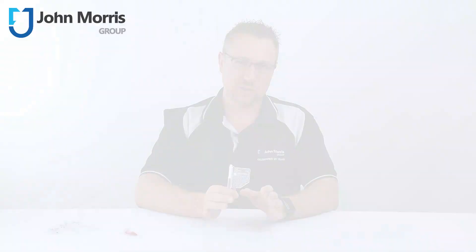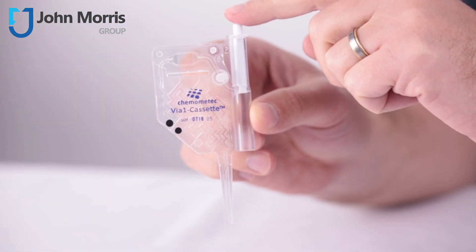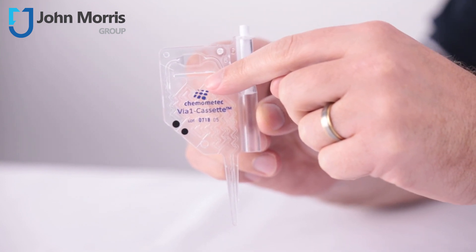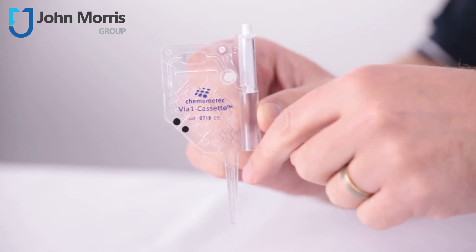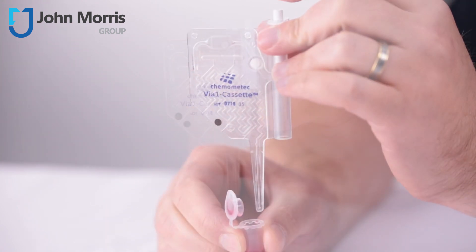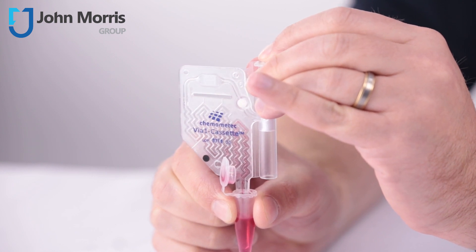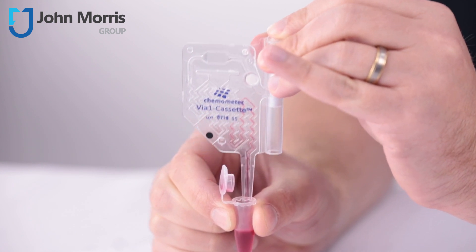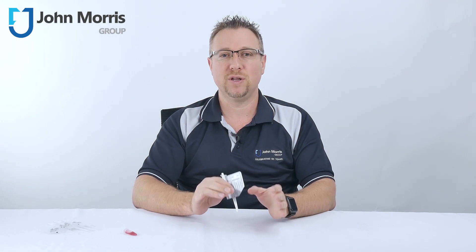And here's how it works. What we have here is a volume laser calibrated cassette, and this is a true all-in-one solution for an optimized cell count. The cassette is a disposable plastic unit that contains the fluorescent dyes acridine orange and DAPI, and that means you don't have to pre-treat your samples. A cell sample can be easily loaded directly into the cassette simply by submerging the inbuilt pipette into the cell suspension and pressing down on the piston. The cells are counted in this counting chamber that you can see right here, and that gives you a total cell count and viability in just under 30 seconds.